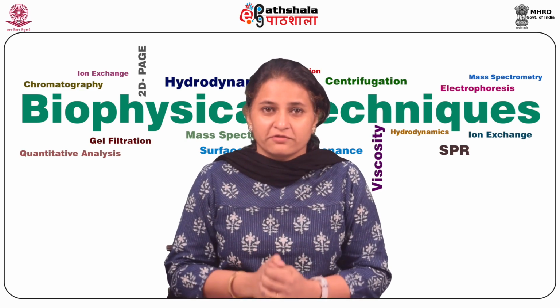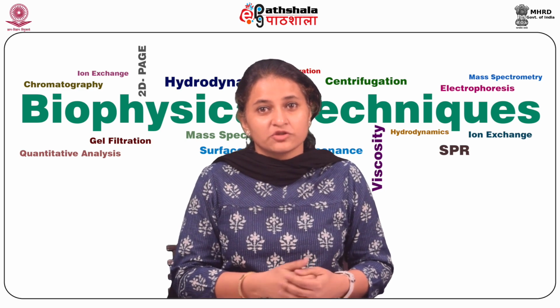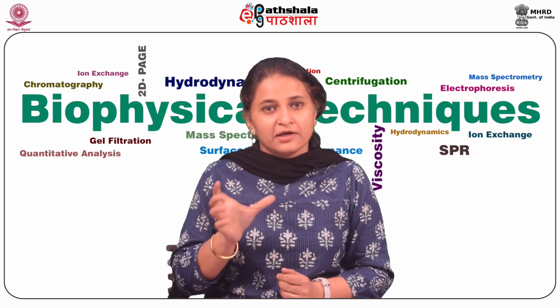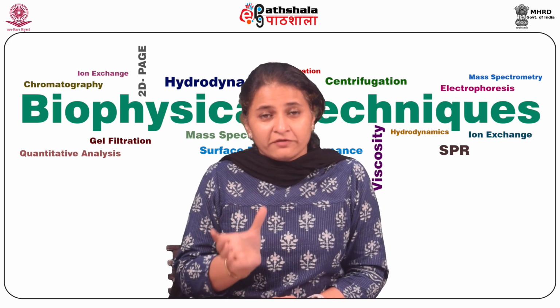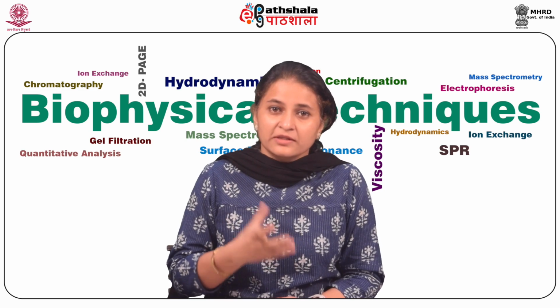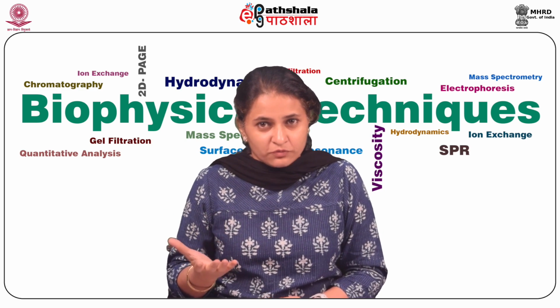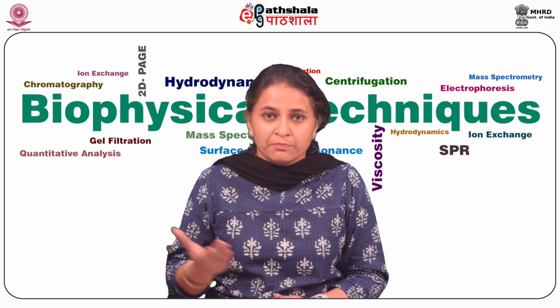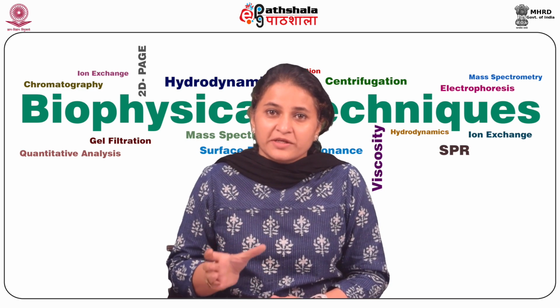However, this process of derivatization that is called trans-esterification, when it is converting them into methyl esters, converts them, as I said, into low molecular weight non-polar derivatives. The good thing about it is that very small amounts of material are required, and in this process the lipids in the sample are first hydrolyzed and then trans-esterification, which is basically an ester exchange process using compounds like boron trifluoride, etc., converts them into the respective methyl esters.